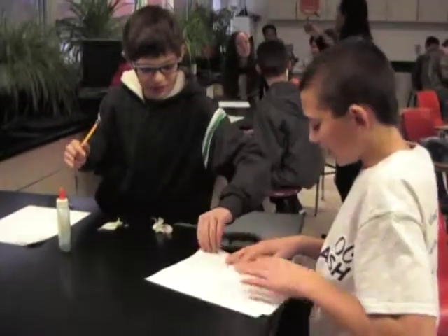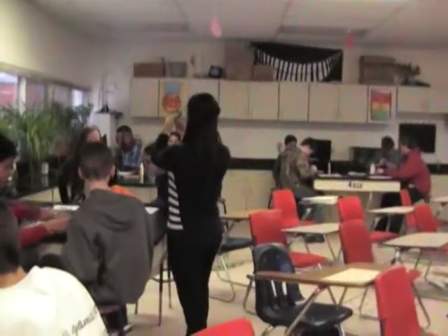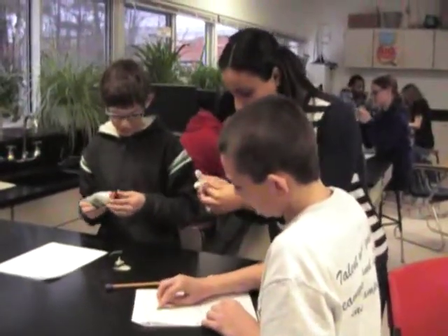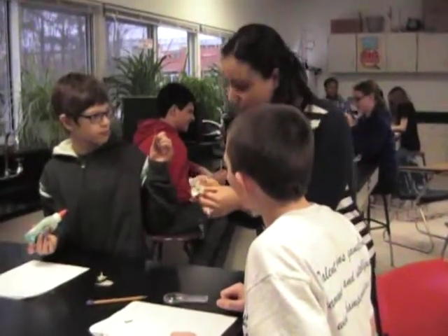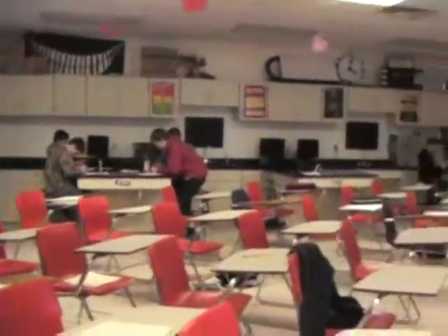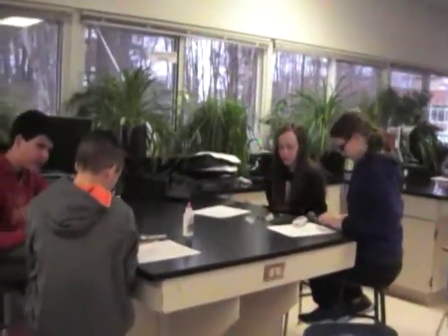You can take the sepals off of the buds if they have it. So some of you might have a bud and the sepals are on there. Otherwise, they might have fallen off the mature flower. That would be the leaf. You got that from over here. Oh, darn. There's a lot on one of your buds. Wait, guys, wait. Their sepals are on one of their baby buds. You have a baby bud in the flower.